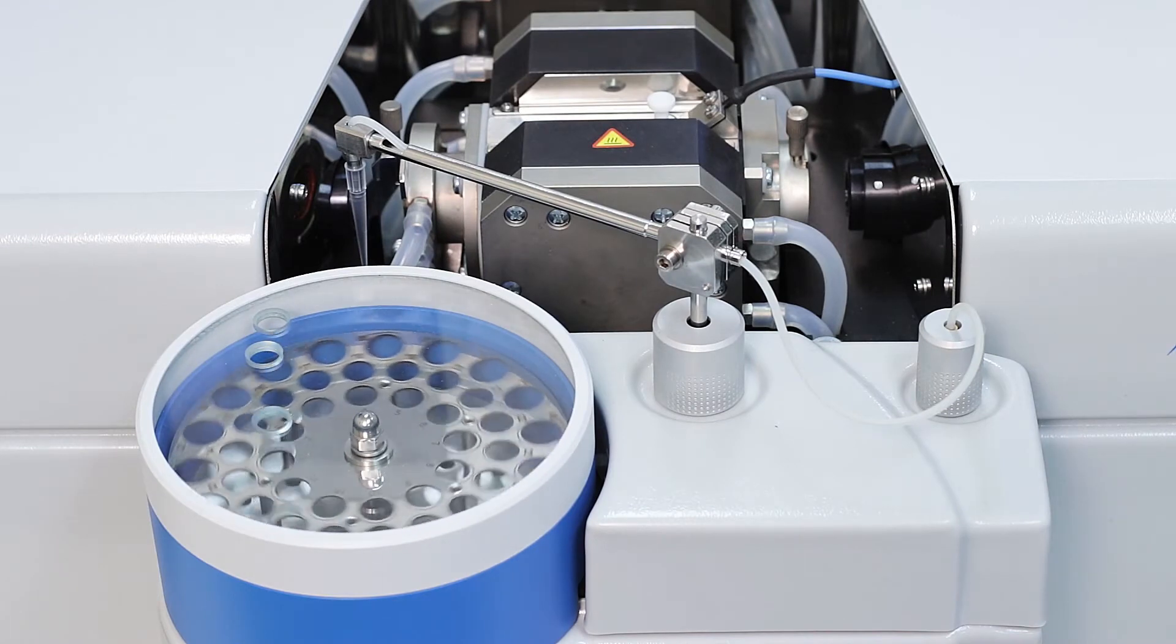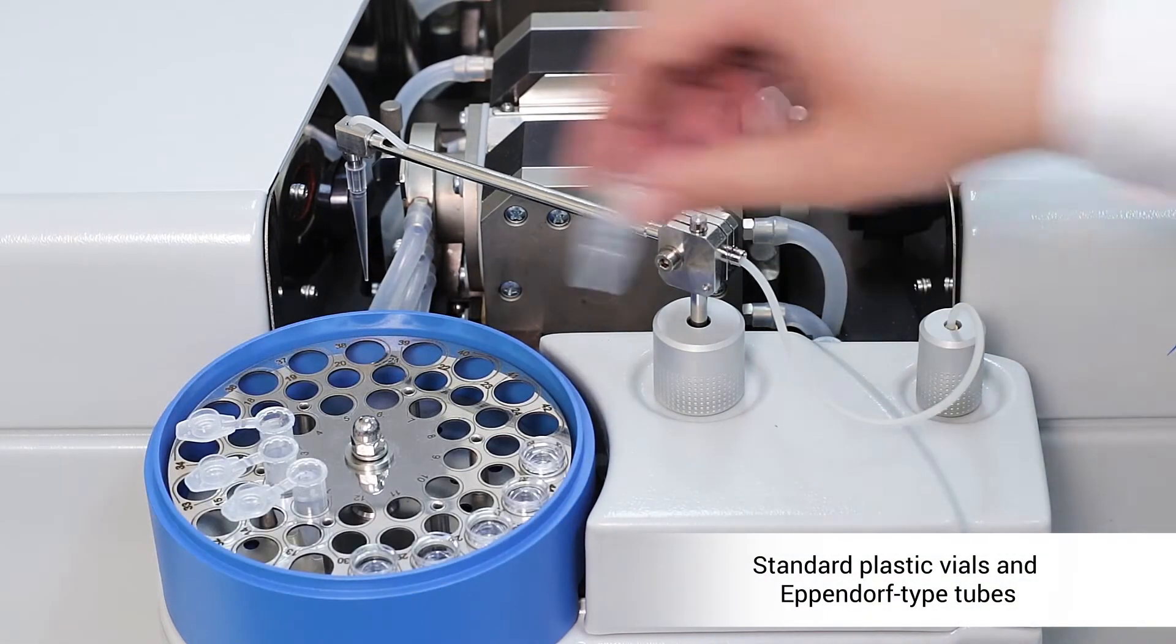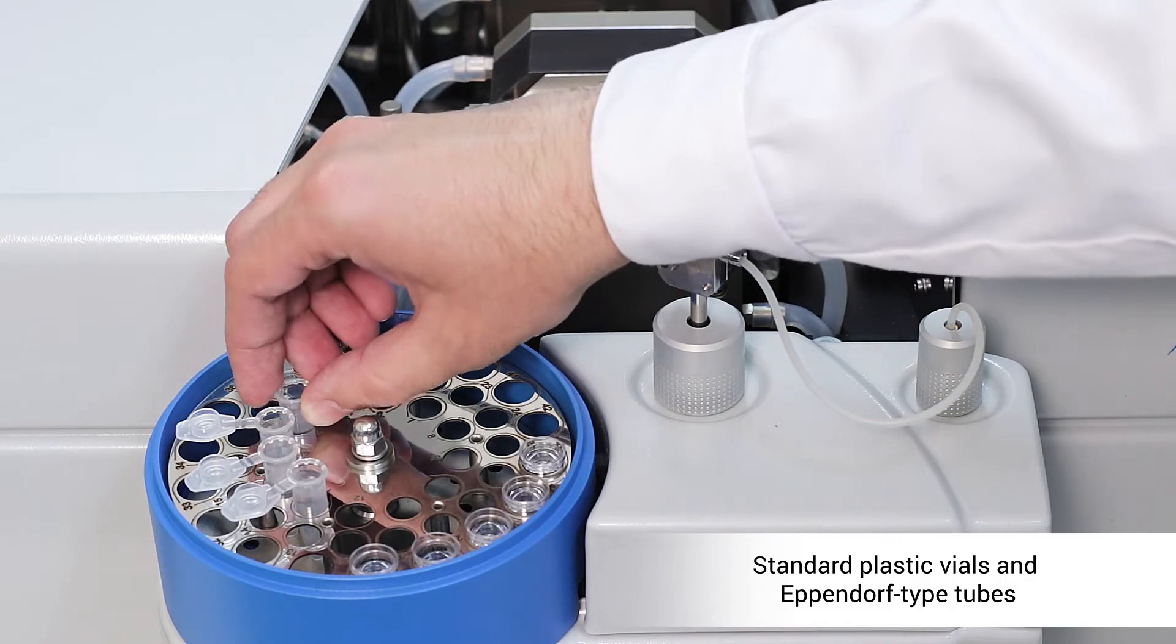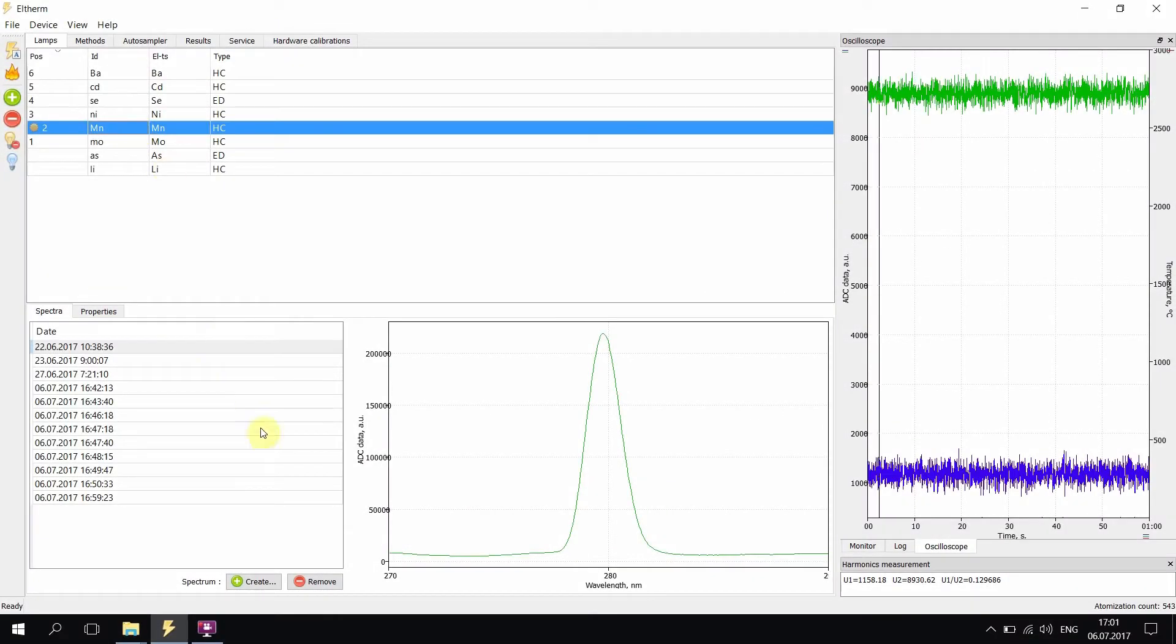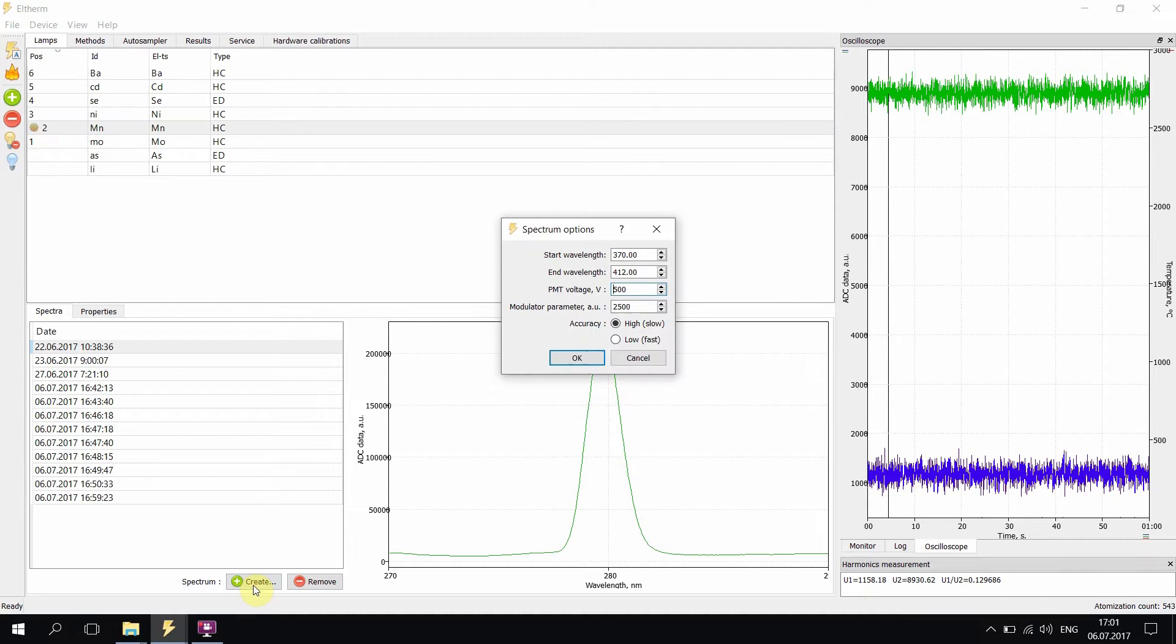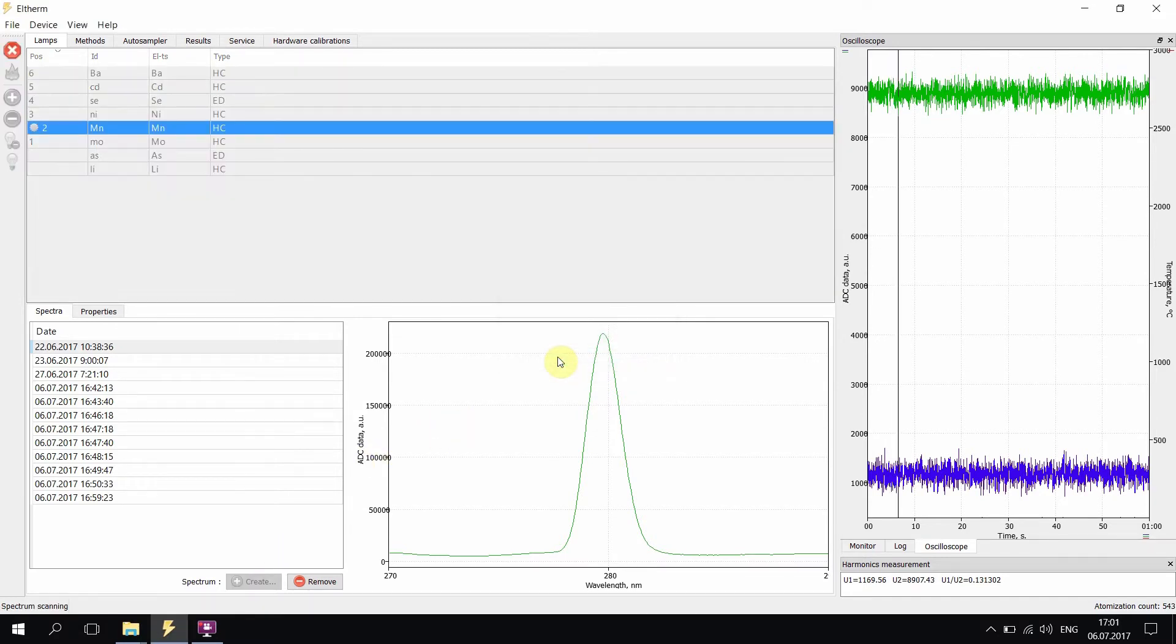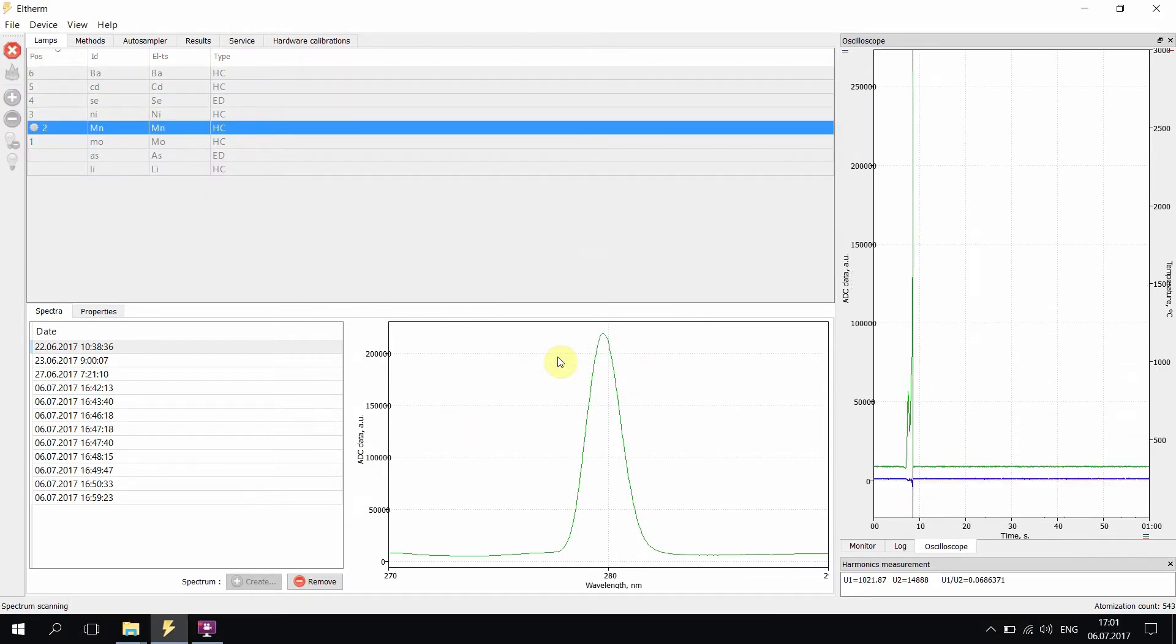The auto-sampler accommodates standard plastic vials and Eppendorf-type tubes. MGA-1000 comes with user-friendly software for setting operating conditions, data storage, and processing.